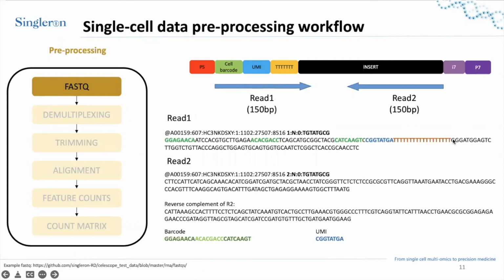Many of the later parts of the sequences will be trimmed off anyway, so we may not be able to use them. So in short, the main purpose of read 1 is to give us the identification of the barcode plus the UMI combinations.